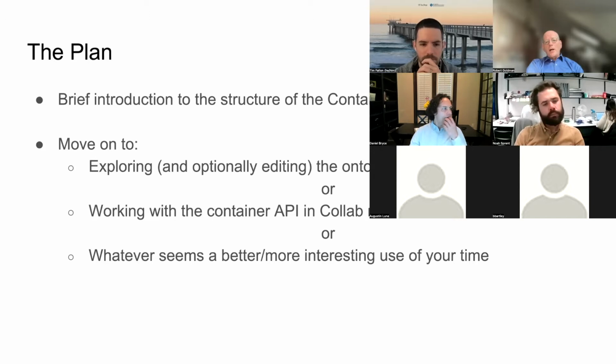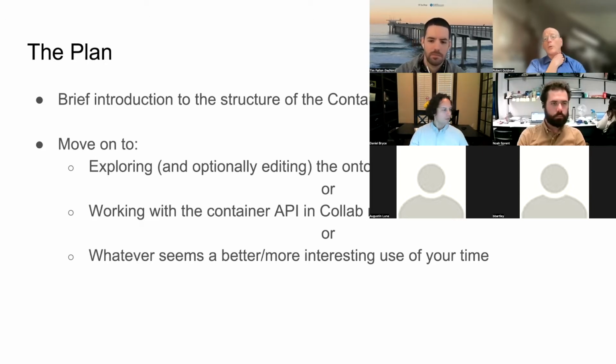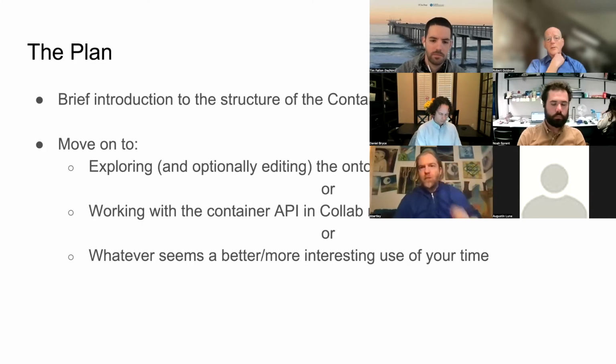One of the things I did was also collect up what I did to translate Stratios's catalog of microplates into the OWL format for use in the container ontology. And I think it would be possible to use that as the starting point for translating the OpenTrons labware catalog, if we're interested in doing that as kind of a project.